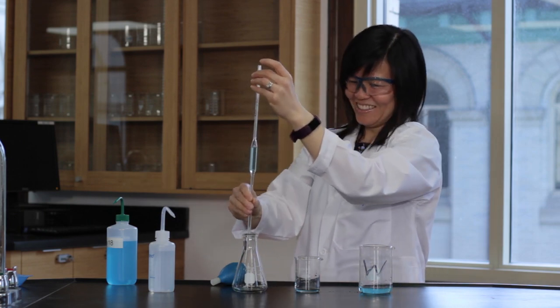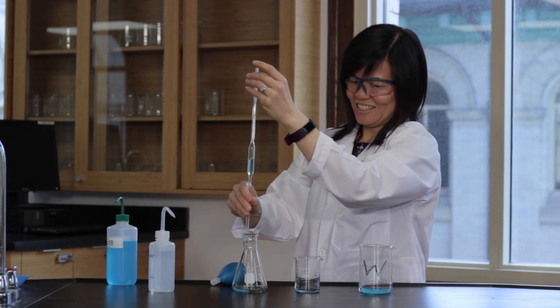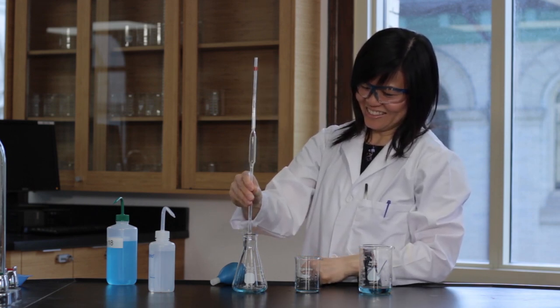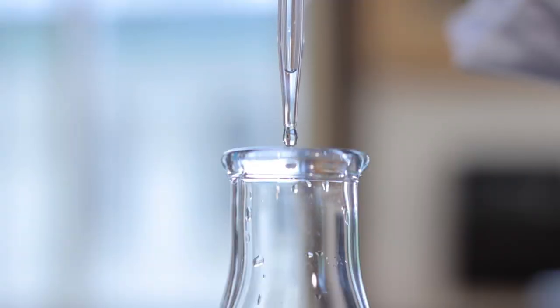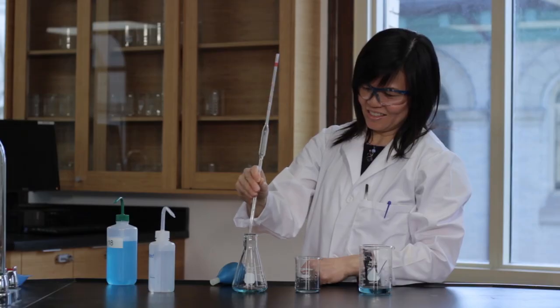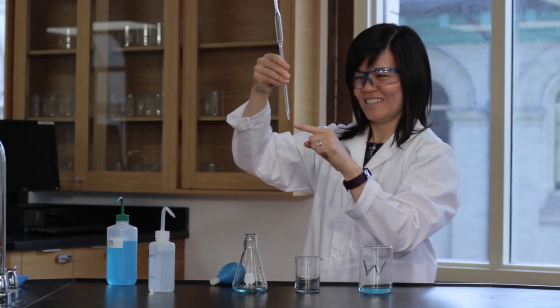Hold the pipette tip against the inside of a clean flask, remove your finger from the stem, and allow the solution to drain by gravity. Touch the pipette tip to the inside of the flask. There will be a small amount of solution left in the pipette tip. Do not blow this out—the pipette has been calibrated to leave this amount undelivered.